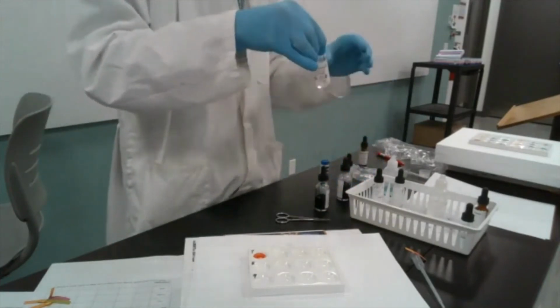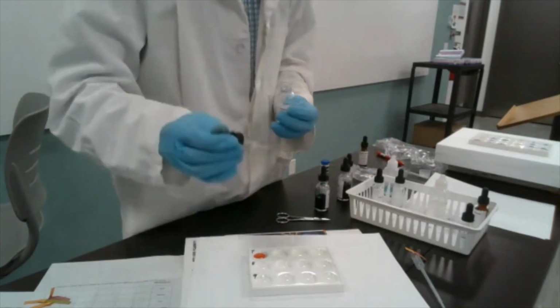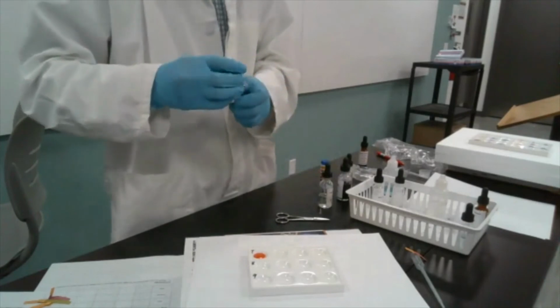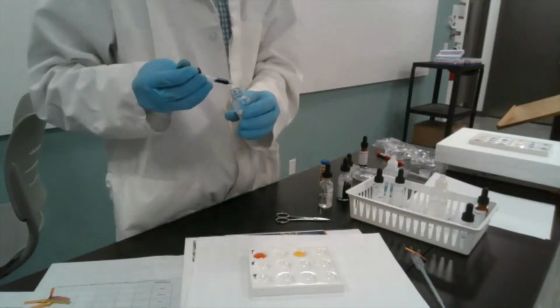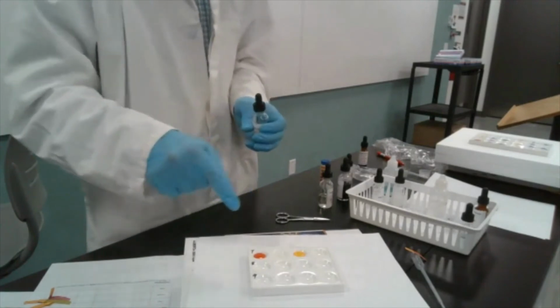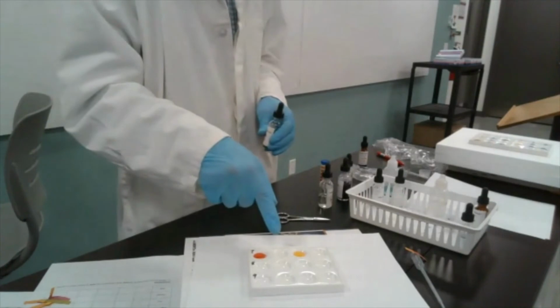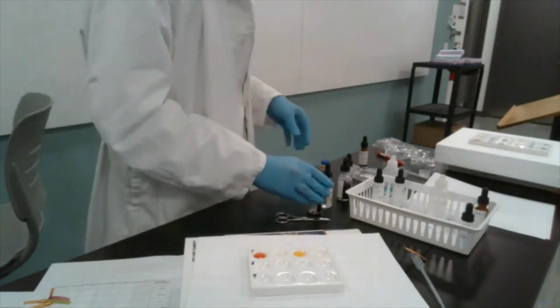You already may see the color change to red. Phenolphthalein, no color change. And finally, bromothymol blue, yellow. So I'm not going to lift it up because you probably see the colors already. Red, colorless for phenolphthalein, and yellow for bromothymol blue.